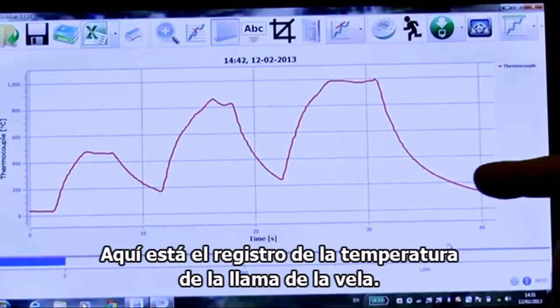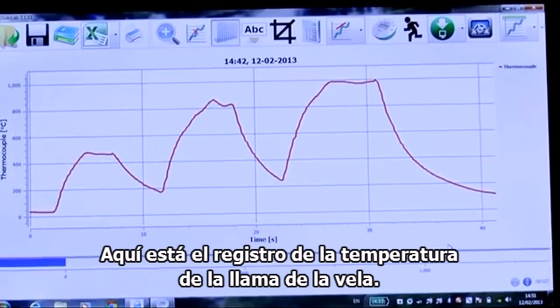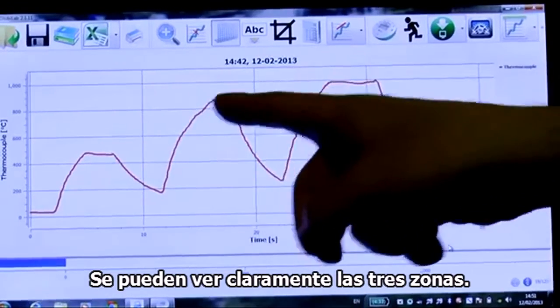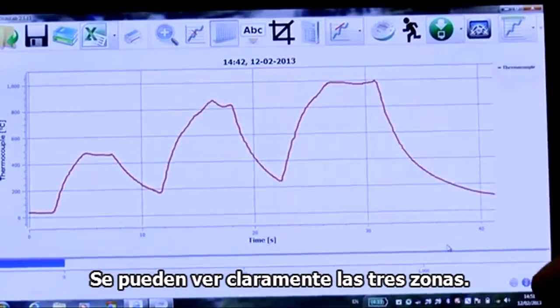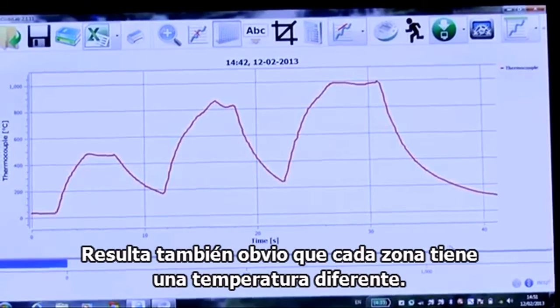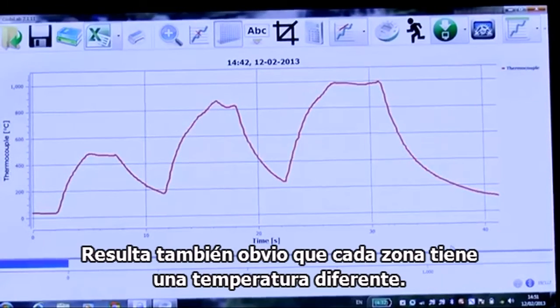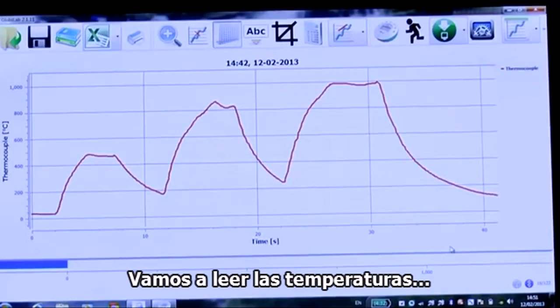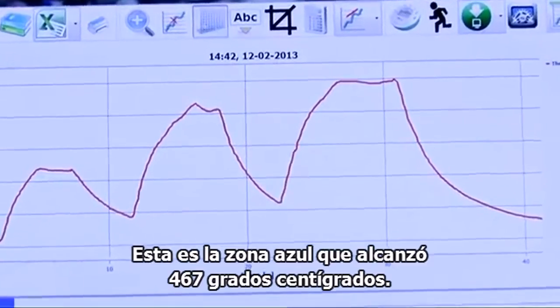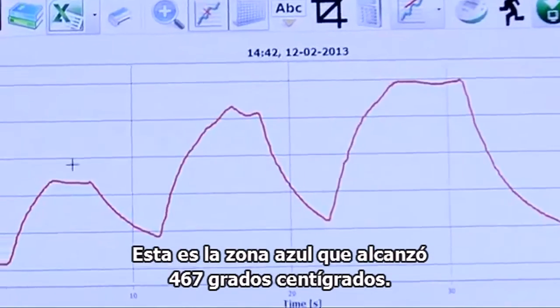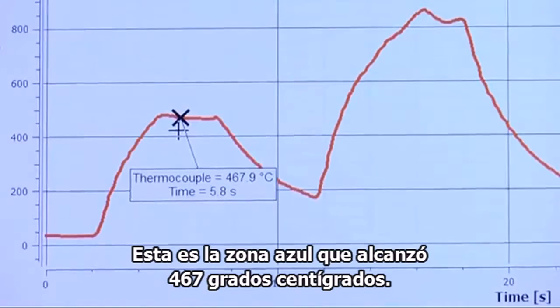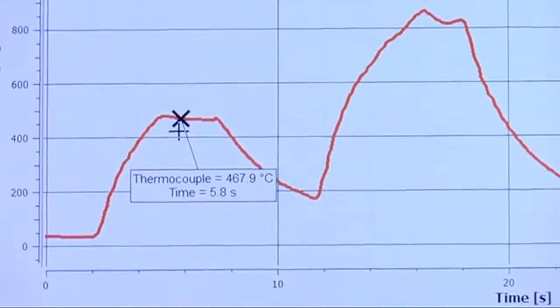Here is the candle flame temperature recording. You can clearly see the three different zones. It's also obvious that each zone has its own temperature. Let's see what the temperatures are. Starting with the blue zone — the temperature was 467 degrees centigrade.